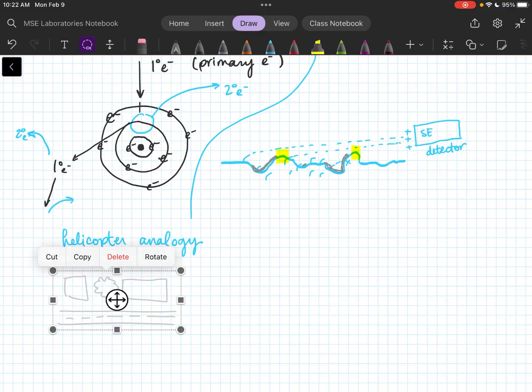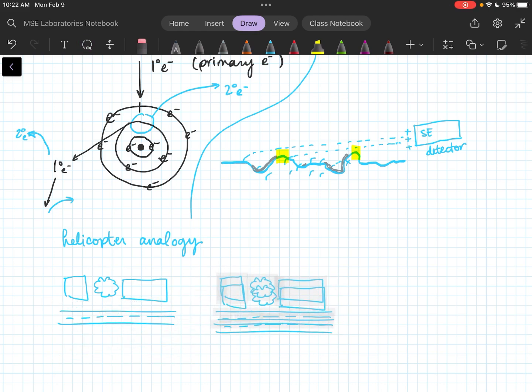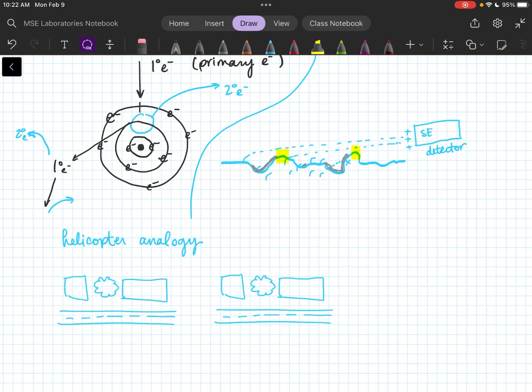If I take that same thing, but now I take a helicopter ride at sunset when I've got these shadows being cast, I would see that this is a really tall building next to a shed, and this would all be filled in, right? Because it's a shadow. And this is actually just a small building. And maybe this tree is a really tiny tree because you can see the shadow. But now, even though we're still seeing in 2 dimensions, we're getting 3-dimensional data from that 2-dimensional view. That makes sense.